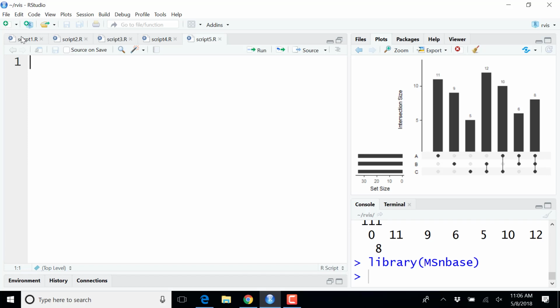Yes? Do you always put the closest cluster on the left and then sort of work from there logically? No. So you can switch these, you can turn these. But there's no preferred method to do it that people like to see? So they are totally equivalent whether I write 3, 5, 1, 4, 2, or I could turn this around and have 1, 3, 5. That's exactly up to you. And it doesn't matter here.